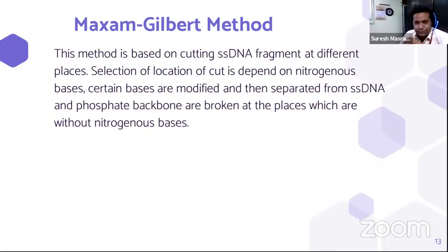This method cuts the single stranded DNA, and manages to cut this DNA fragment at different locations. It makes specific cuts of the fragment, and then visualizes only one part of the resulting DNA fragments.